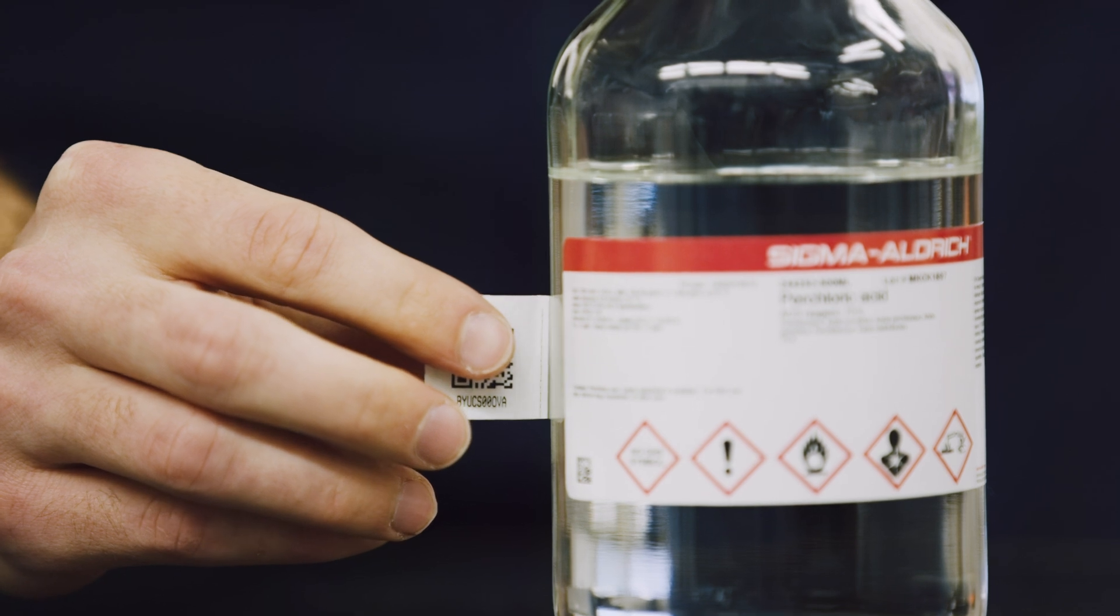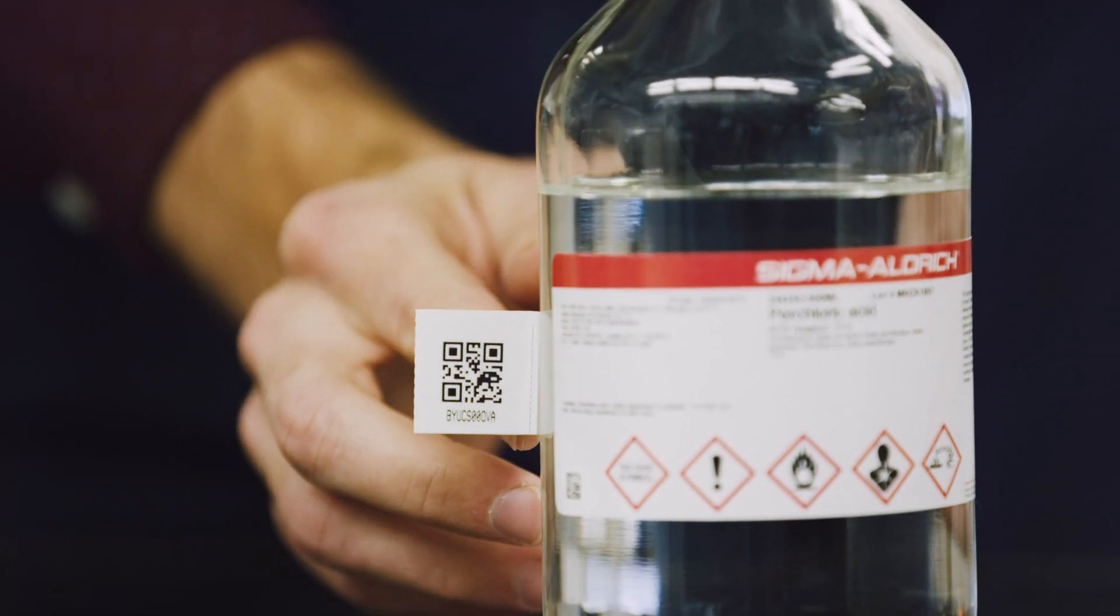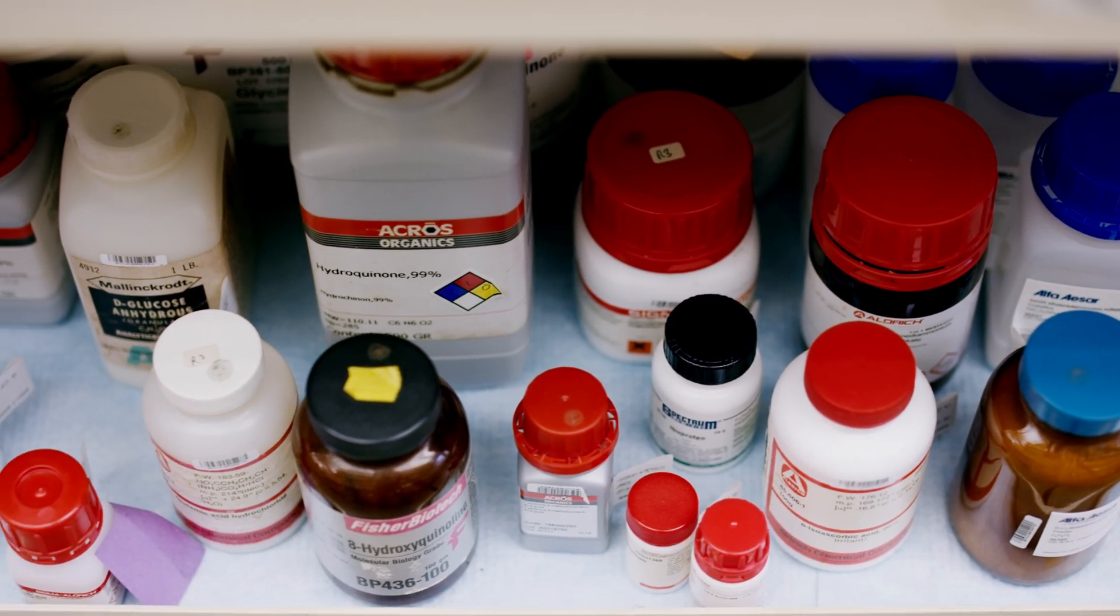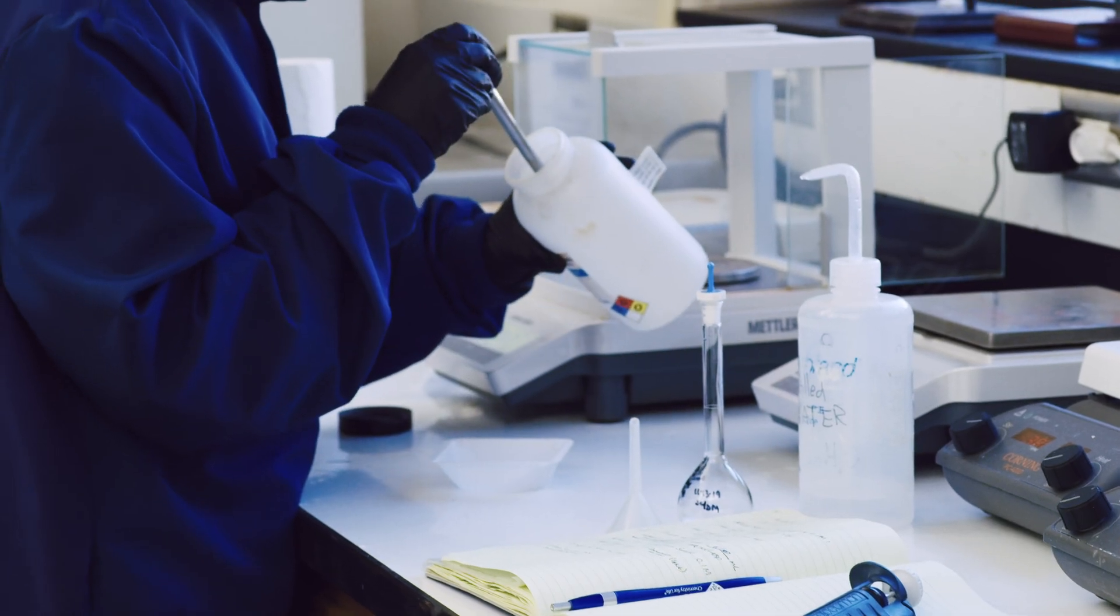RFID tags tend to be ineffective when placed flat on metal containers or when used on liquid bottles, but we were able to find these RFID flag tags that stick off of the chemical bottle that allows us to use this RFID technology without it being interfered by the chemical or chemical bottle.